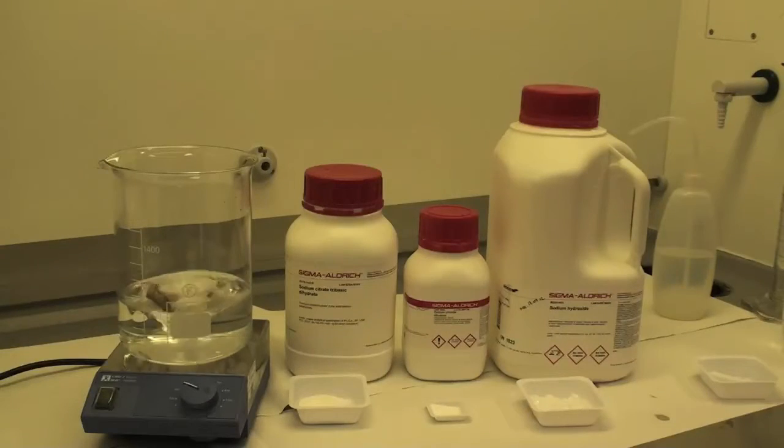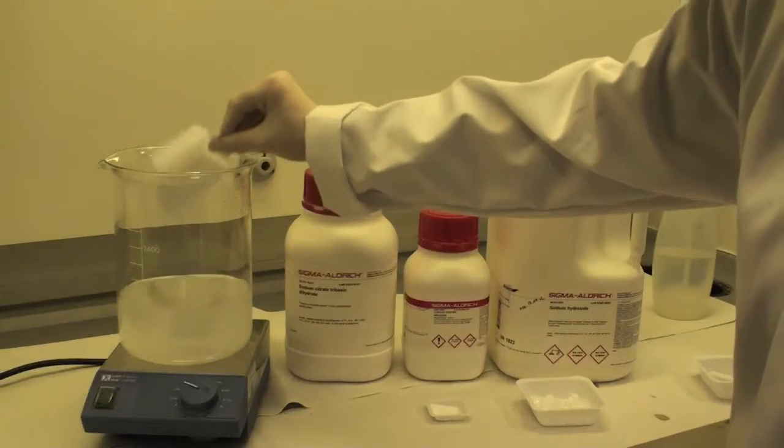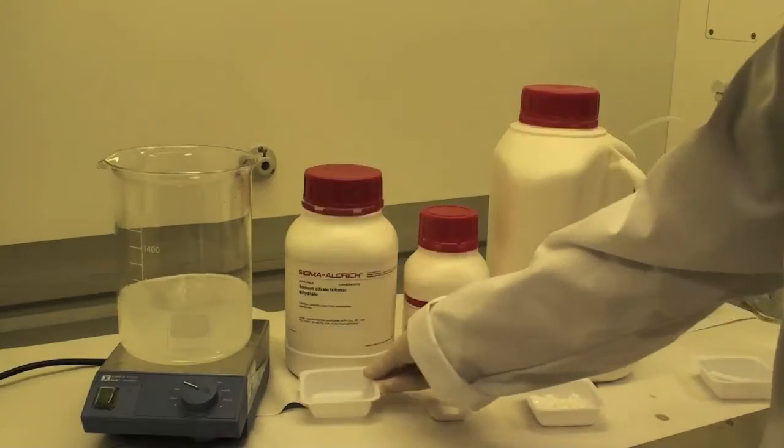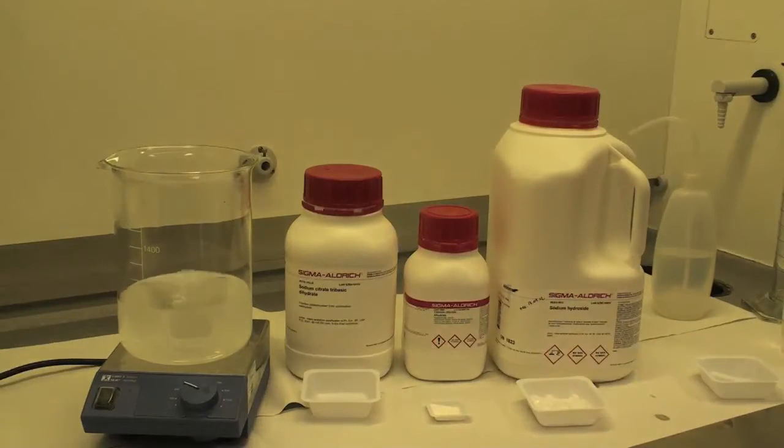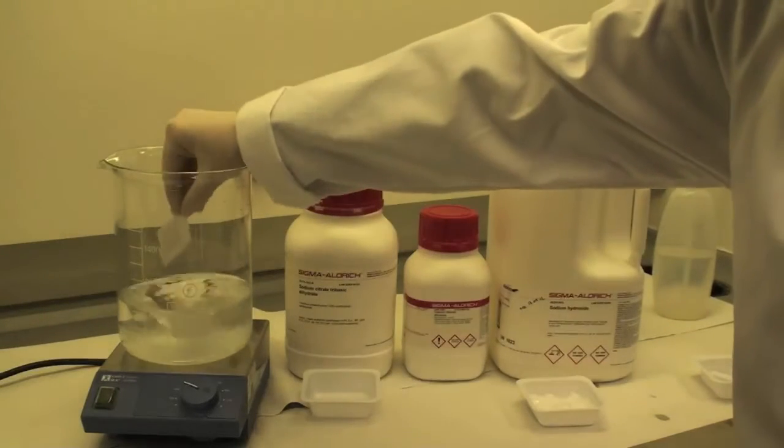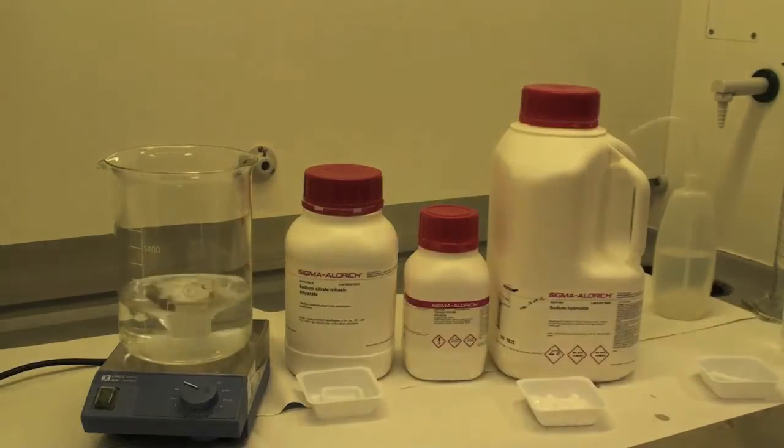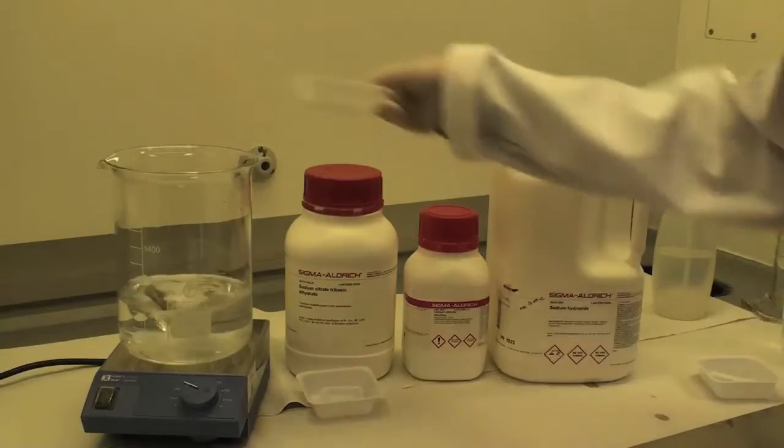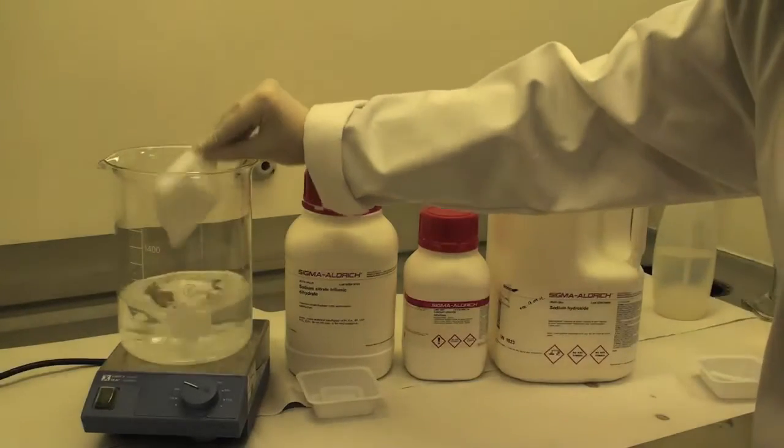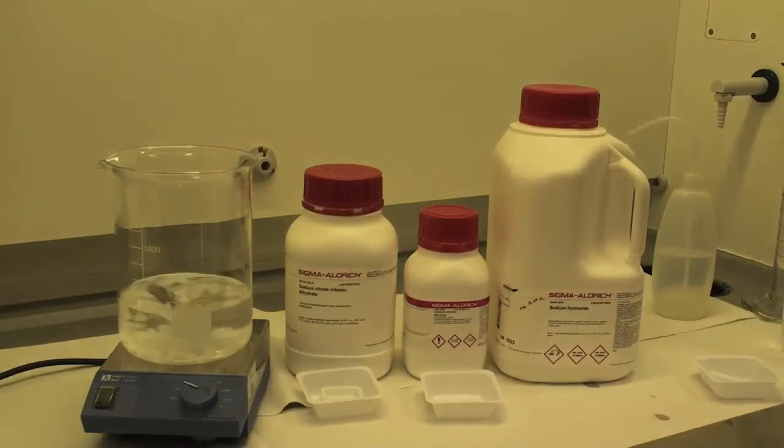Prepare PAHBAH solution B by adding 24.9 grams of trisodium citrate dihydrate to 500 mls of distilled water and stir until it dissolves. Then add 2.2 grams of calcium chloride dihydrate and dissolve this by stirring. Then add 40 grams of sodium hydroxide and also dissolve this with stirring. The solution may be milky but it will clarify when the solution is diluted to 2 liters.